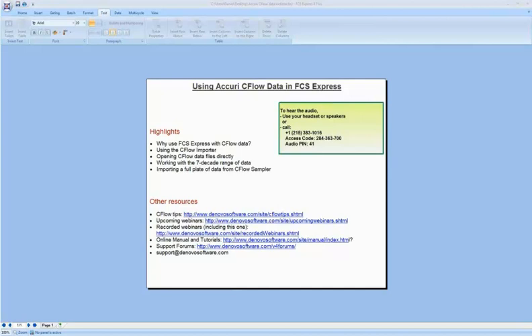So I'm going to take you through the basics of using the CFlow data in FCS Express, and then you'll be able to ask any questions you have about that or about other questions about FCS Express during the course of this webinar. Just feel free to type them into the question and answer box. And we have Tanya helping out today. She's going to be answering all the questions that you type in.